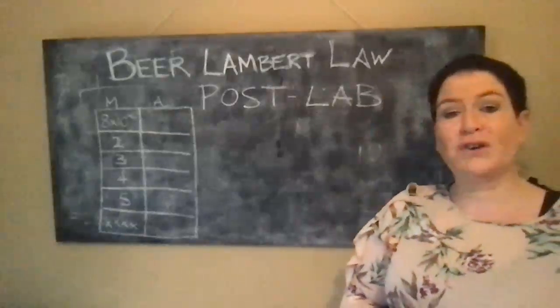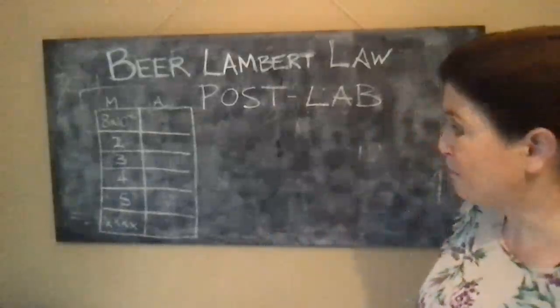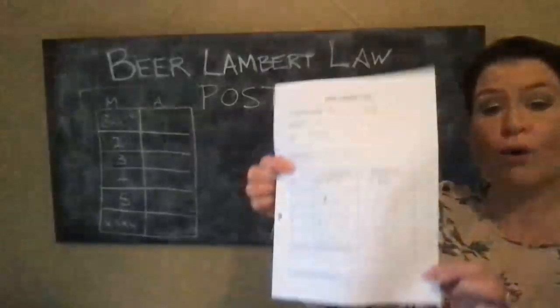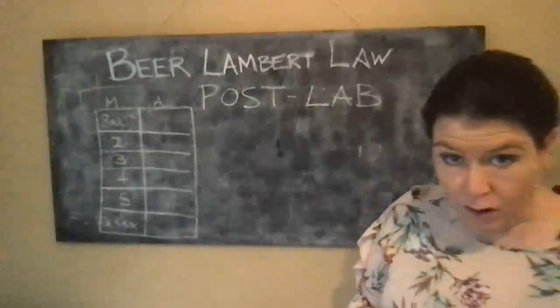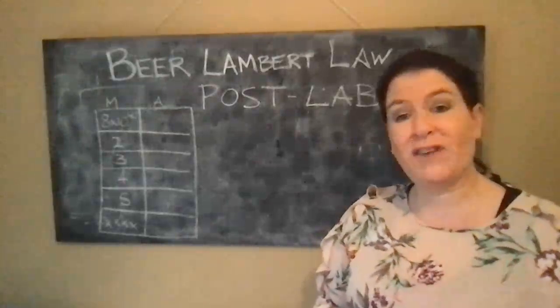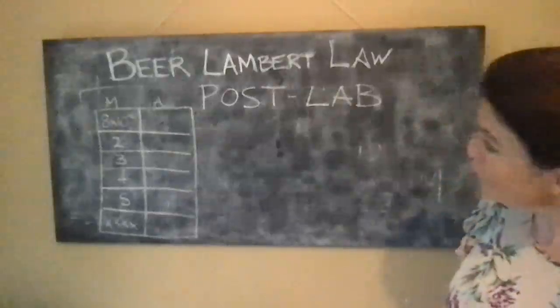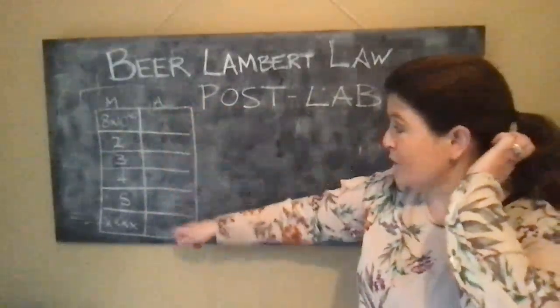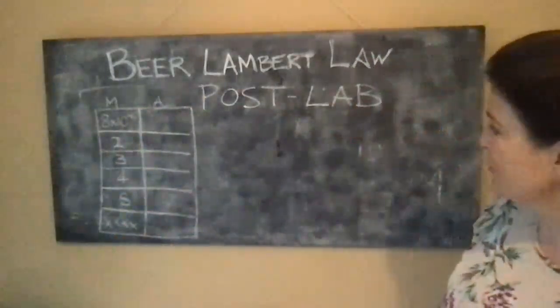And then you'll come to present your data, and this needs to be presented, and again remember you need to have a copy of your own raw data as a sheet as part of your PDF. So you need to create it as part of your PDF to show that the data for the graph that you've drawn is your own data that you've used in the lab. So you'll have a chart that looks something like this with various absorbance values on it. Molarity, I haven't given them to you. You'll be working those out yourself.